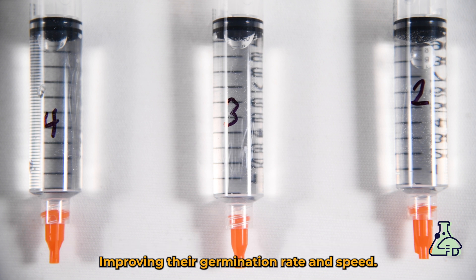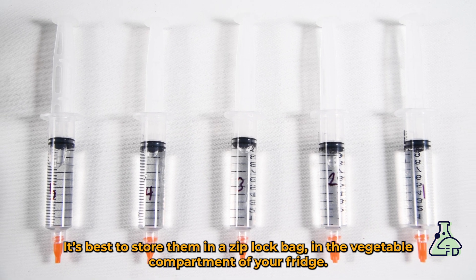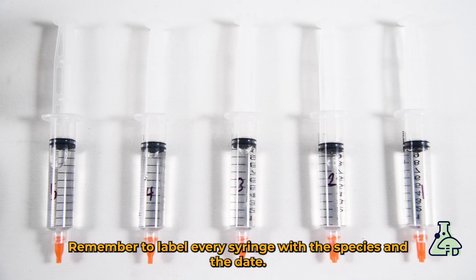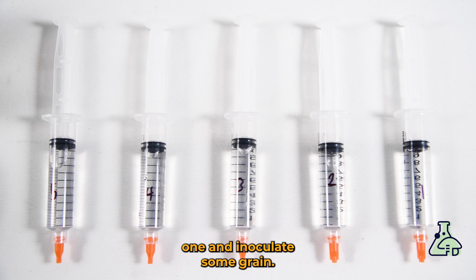You can store these for six to twelve months away from light and heat. It's best to store them in a ziplock bag in the vegetable compartment of your fridge. Remember to label each syringe with the species and the date.